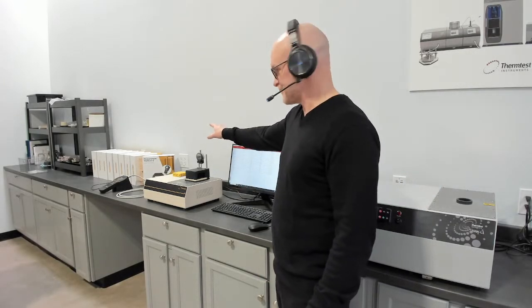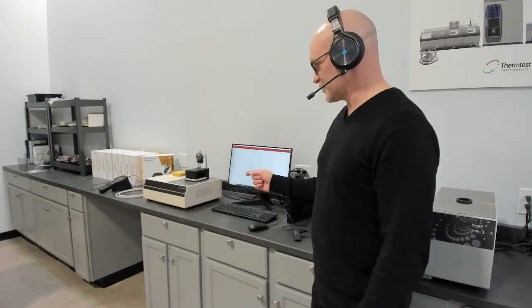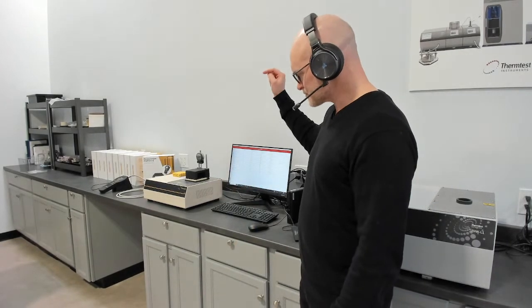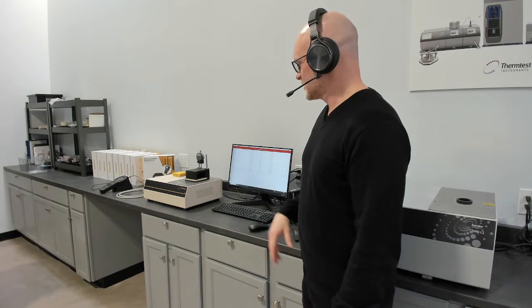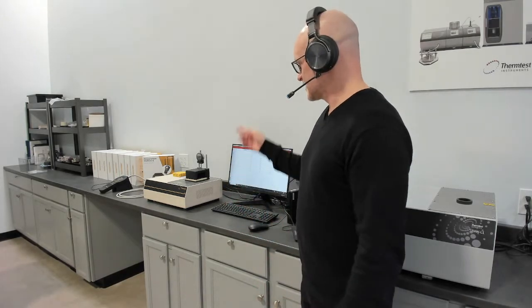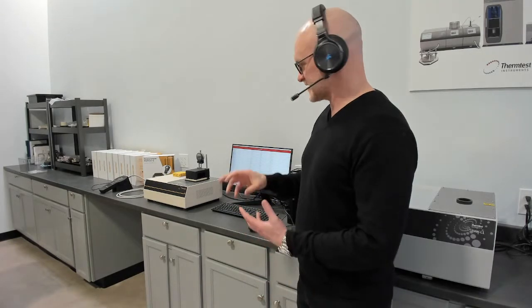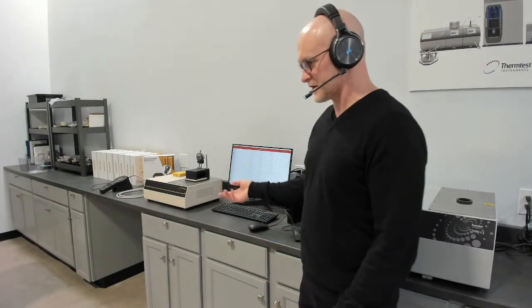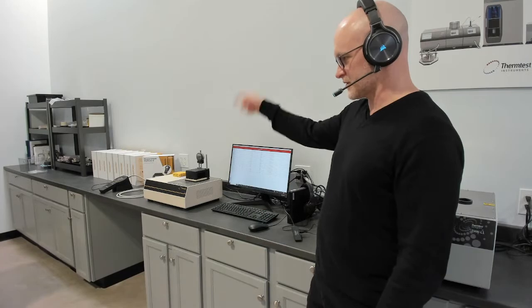And then down the end of the bench is our MP2, the baby brother to the MP1 which is measurement platform. There's a series of primary purpose sensors. So that means design for use. Transient plane source for doing single-sided testing. Transient hot wire for liquids. Transient line source for soils, etc.